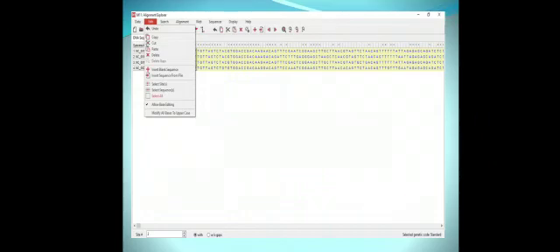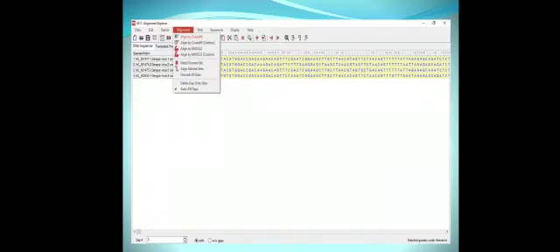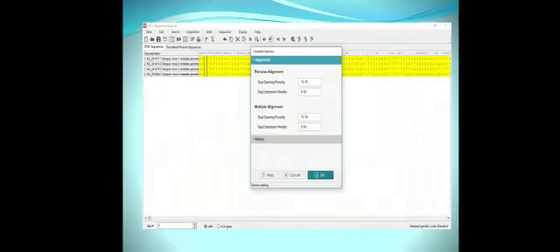To perform multiple sequence alignment of all these sequences, we have to first select all the sequences. So in the Edit option only, you will click the Select All option. After that you will move to the Alignment tab, and there you will select the type of sequence alignment method that you are using. So here we are aligning the sequences using the ClustalW method. Once you click on the ClustalW method, it will ask you about the parameters, and a window will open that will show you different parameters. For the majority of the time we keep all the parameters as default only. We will select all the parameters as they are and click on the OK button.